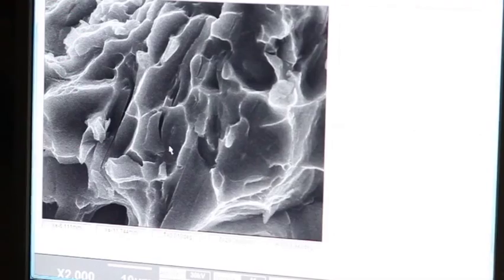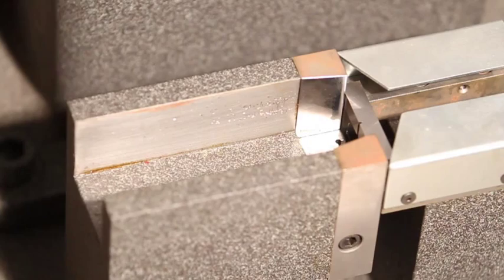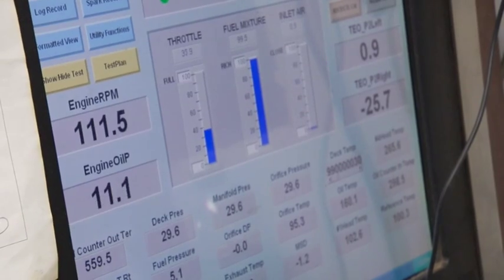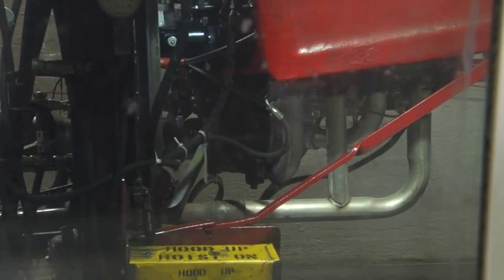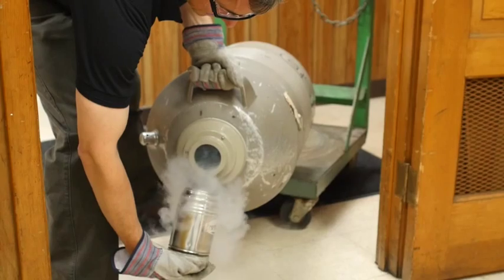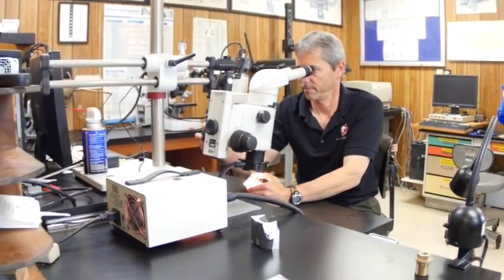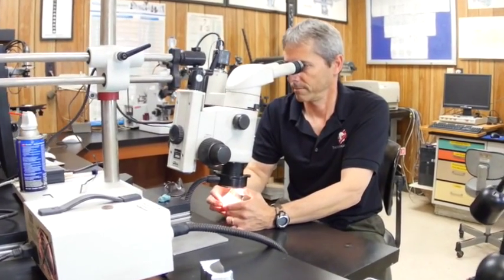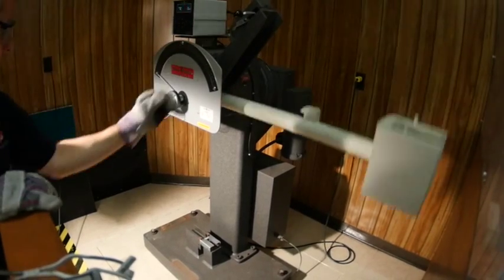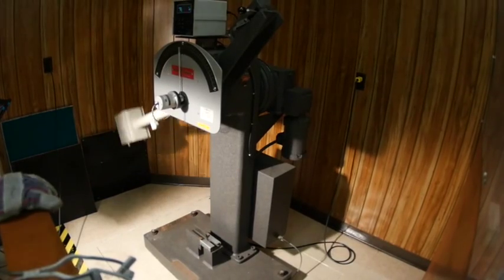The equipment includes two scanning electron microscopes, fracture analysis equipment, stress test equipment, non-metal analysis tools, an x-ray machine, a chemistry laboratory, and more. Lycoming's material laboratories are as well equipped as the world's finest advanced university research facilities.